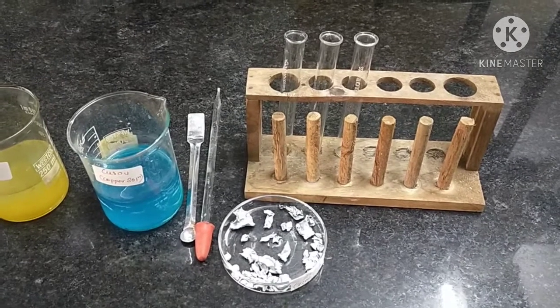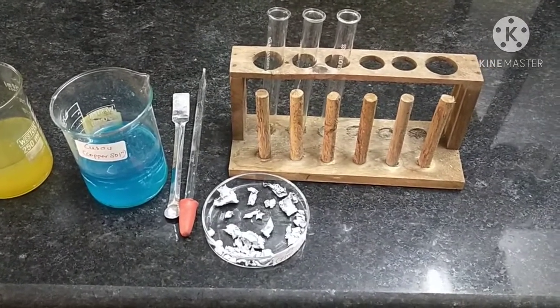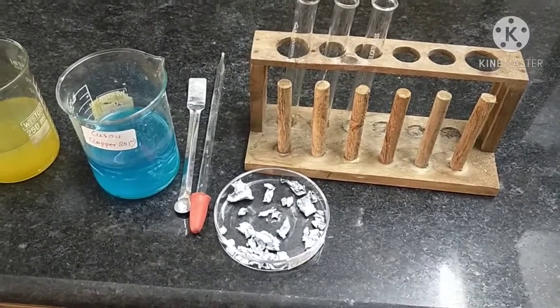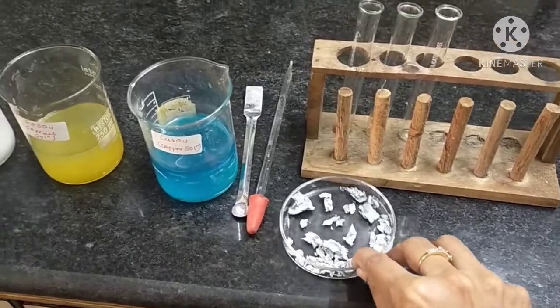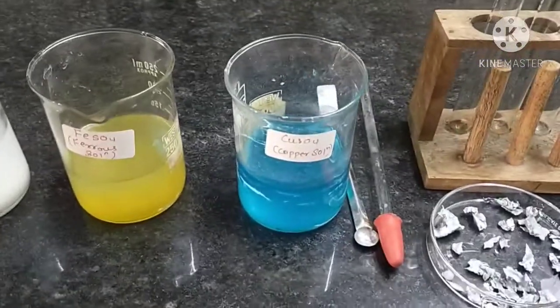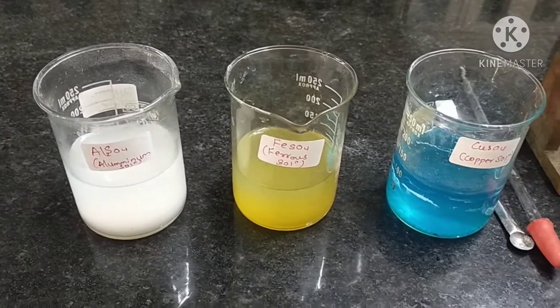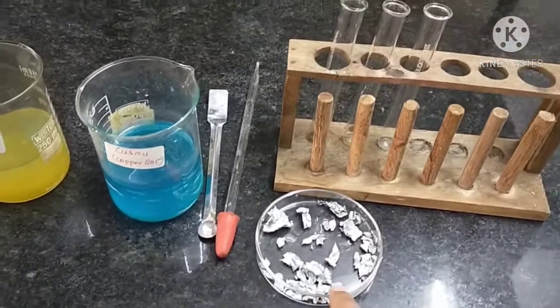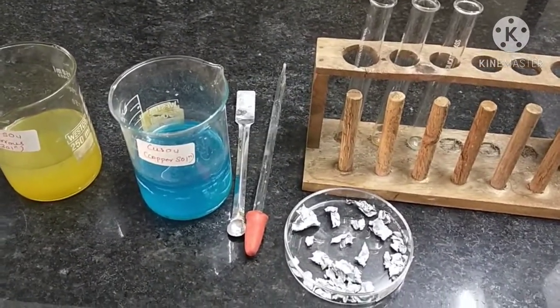First, reaction with zinc metal. In this experiment we require test tubes, test tube stand, spatula, one dropper, zinc metal, copper sulfate solution, ferrous sulfate solution, and aluminum sulfate solution. In this particular experiment, zinc cannot react with its own salt, that is zinc sulfate solution.